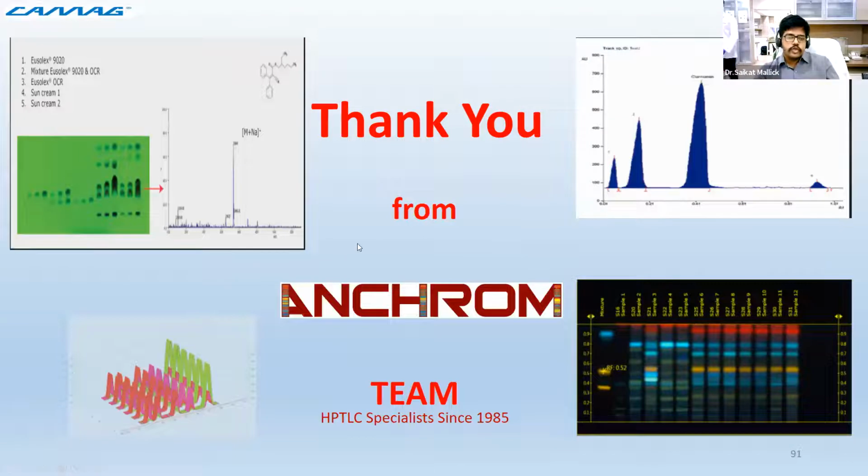Now we will switch over to the practical aspect of this format and understand one of the investigations of effect directed analysis. So I will just stop sharing my screen and now call in my subordinate, Mr. Vishwajit, to take over the session, and we'll start with the bioautography studies.